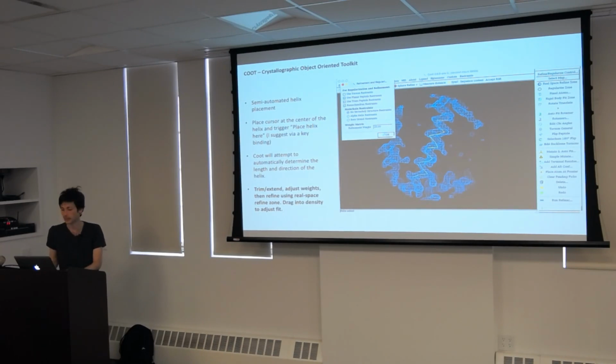Oh, the other thing is I would add secondary structure restraints whenever possible if you're at moderate resolution. They really help with keeping your helices helical and making sure your carbonyls don't flip around all over the place.